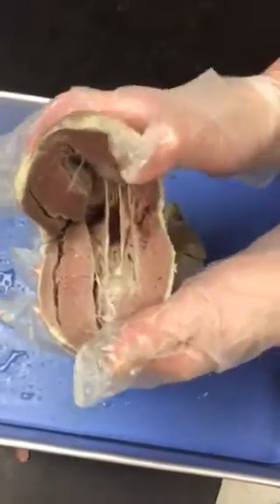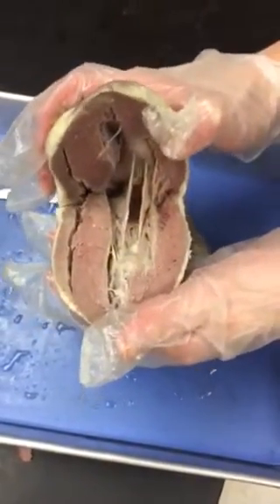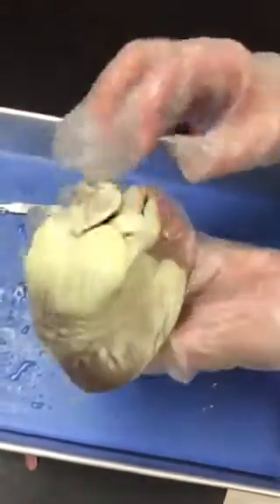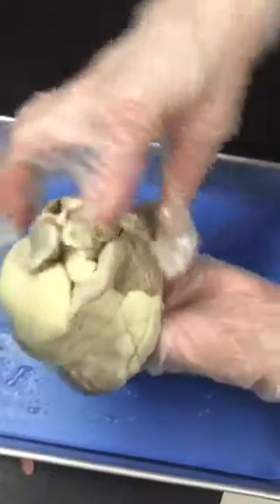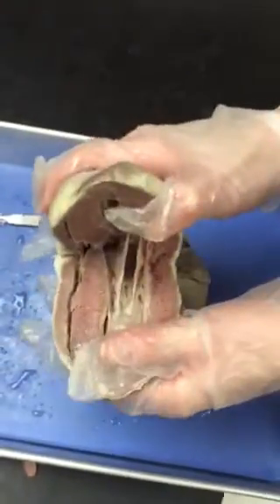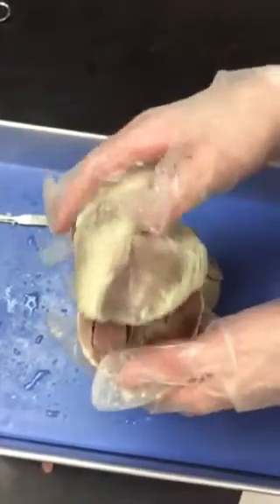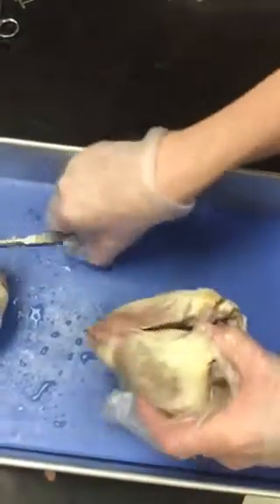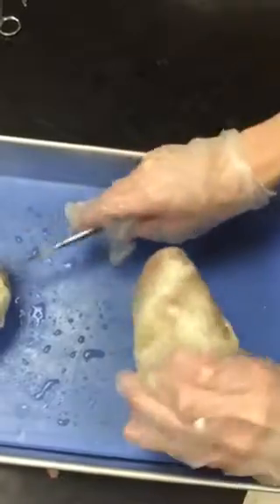41. Cut open the other major blood vessels you labeled in the external dissection. In the space below, describe how the thickness of the aorta compares to the other great vessels. Provide a reason for this difference. 42. Use your scalpel to cut the heart almost in half. The cut should go through the middle, but not all the way through to the other side. Leave a flap holding the organ together.